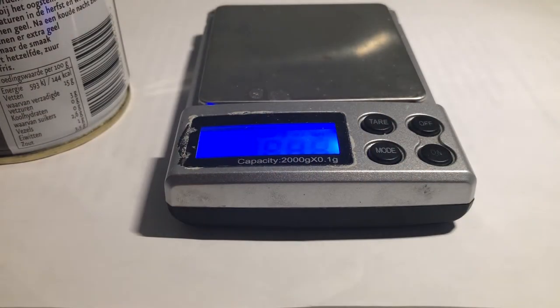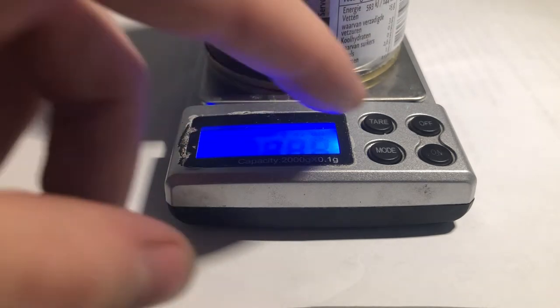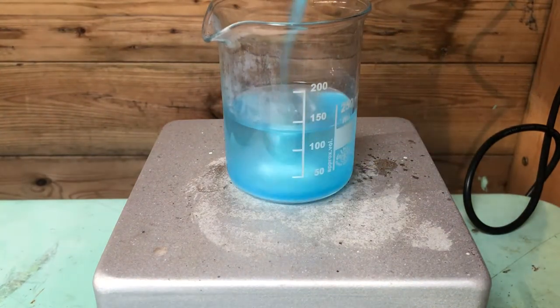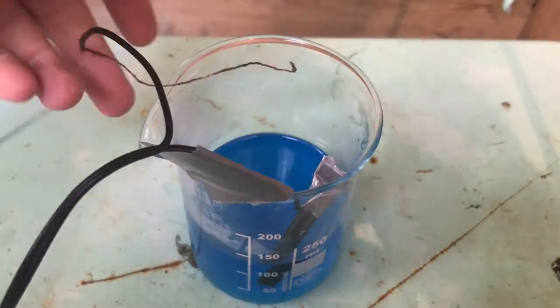I weighed about 250 grams of copper sulfate pentahydrate. You can use any amount — it will just take longer if you use more, but you also get more sulfuric acid. I dissolved the copper sulfate in about 150 milliliters of water. After all of the copper sulfate has dissolved, I taped both electrodes to the side of the beaker so they're hanging almost completely in the solution.